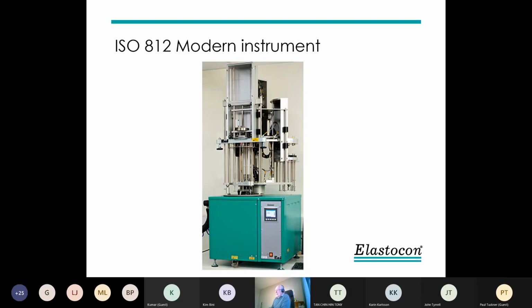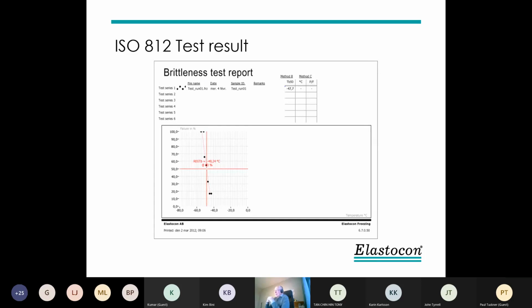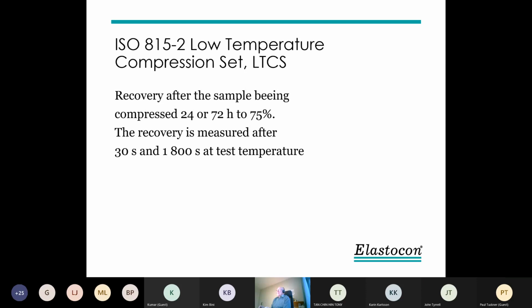This picture is a little wrong. It's only 1 weight to test. It should normally be 4 or 5 weights. A report can look like this, especially if we do the so-called 50% evaluation. So we have results at different points. The computer doesn't make too many calculations here, in fact.